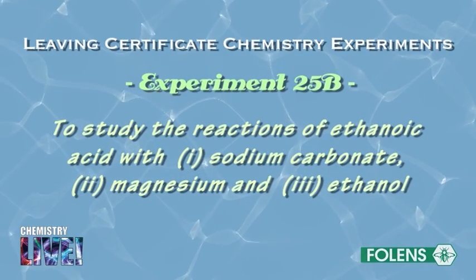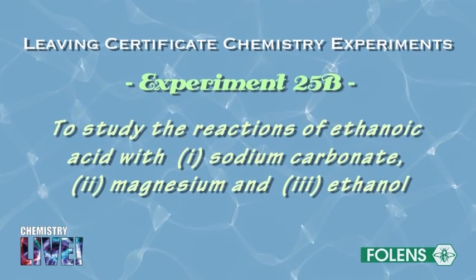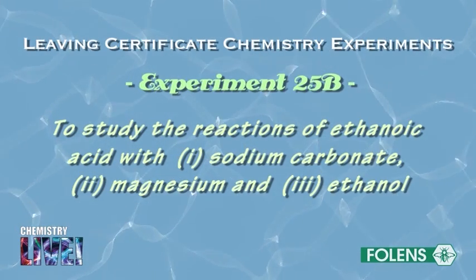Experiment to study the reactions of ethanoic acid with sodium carbonate, magnesium, and ethanol.